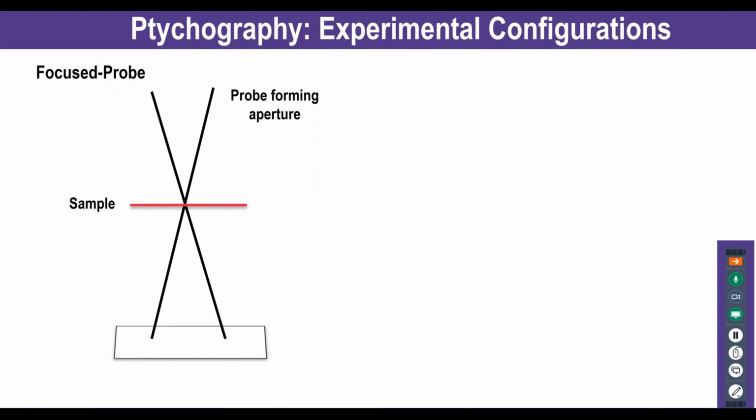I'm just going to take a step back here and introduce a little bit of ptychography for those that are not aware of it. It is pretty much a computational imaging technique. We use the fact that detectors can record an extensive data set consisting of many interference patterns. If you remember a couple of slides ago, I showed some of the CBED patterns, right? You can see the overlapping disks, and that shows the interference between the adjacent patterns here. And then of course, we apply a computer algorithm of some type. There are many types around today, depending on the experimental configuration as well.